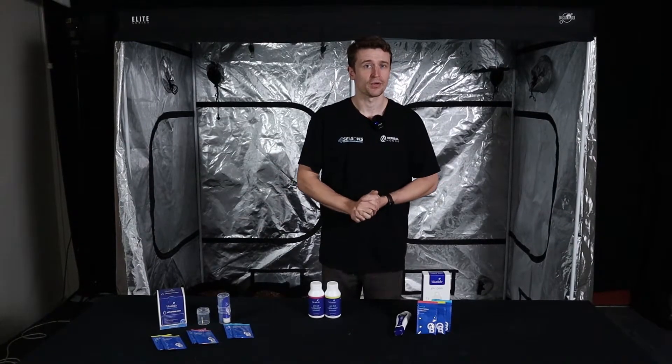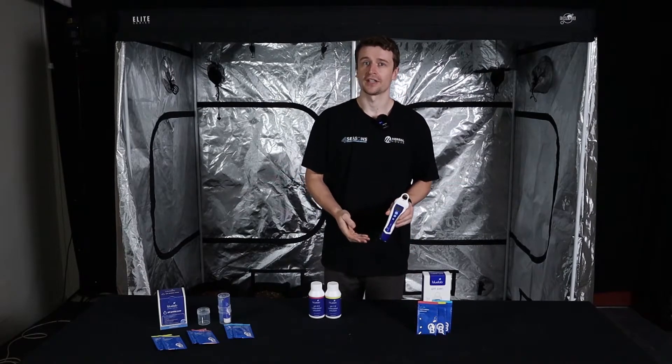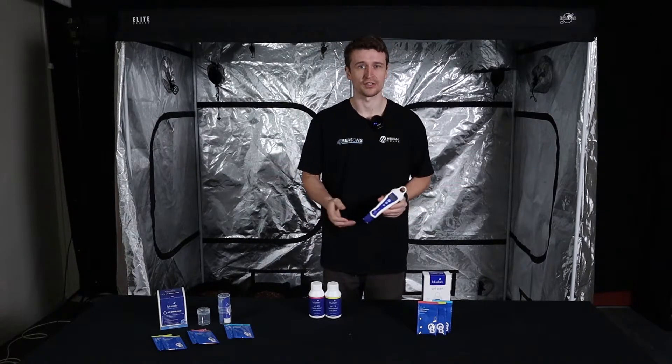Hey everyone, Matt here from Herbal House. In this video we're taking a look at BlueLab PH pens. I'm going to show you how to calibrate it and care for it, because it's quite important to make this equipment last a lifetime — and they certainly do, you've just got to look after them.